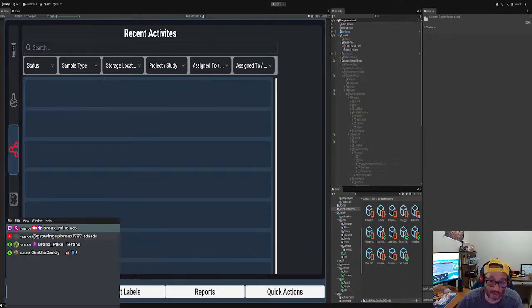Okay, so now what was left to do, let me see what else is there to do. To-do list, to-do list, to-do list. Test results panel.